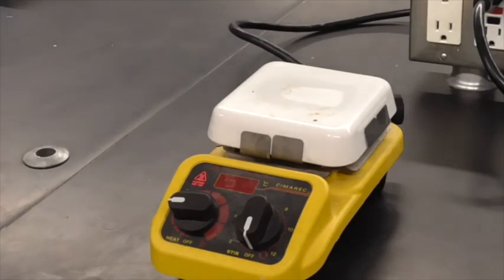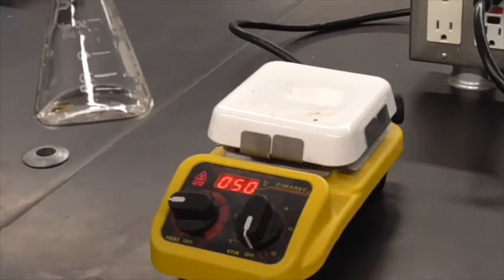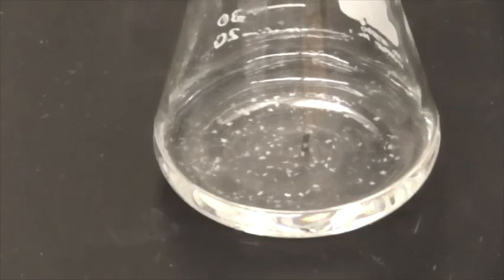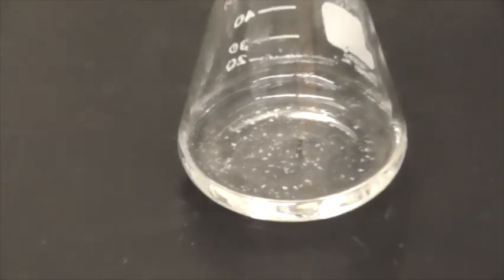See how everything's dissolved. So now I'm just going to let it cool for a little bit, and then we're going to put it in the ice bath. Alright, so we're over by the ice bath. I want to see if we can see. So I'm zooming in on the bottom of our container, and those little white dots are crystals of the aspirin starting to form. So I'm going to put that whole thing now in the ice bath.